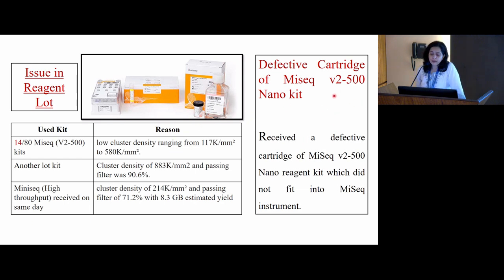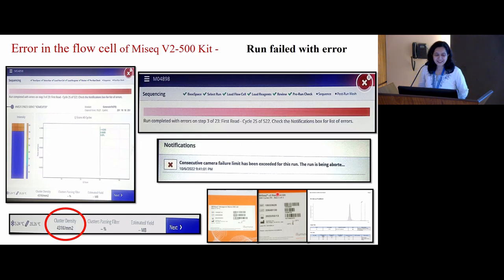Also, we received a defective cartridge of MiSeq, in which the cartridge did not fit into the MiSeq instrument. So before loading the samples, when everything is ready and you are going to load the sample, you come to know that the cartridge is not going inside, and it creates frustration at that time.